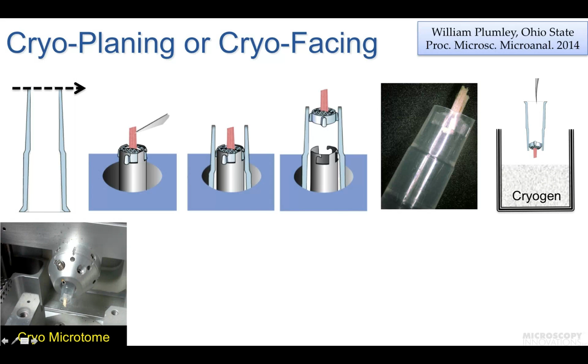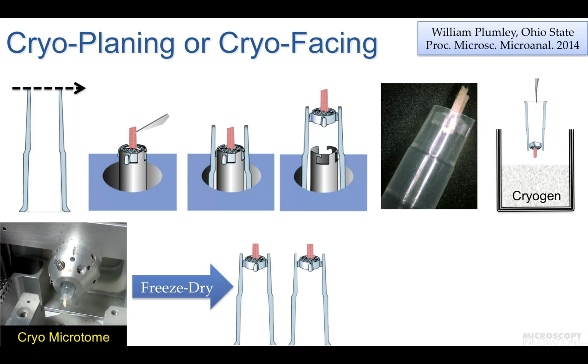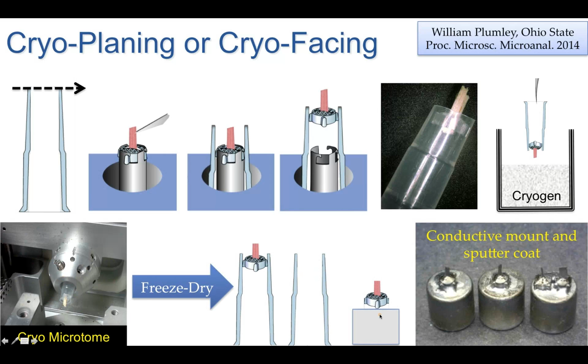The capsules were then directly clamped into the microtome chuck. And the front end of the specimen was now faced through to expose an internal surface. After multiple capsules holding multiple specimens were cryosectioned, they were then all freeze-dried. And then the screens were used to transfer the specimen directly to the SEM stub, and this is what it looks like.